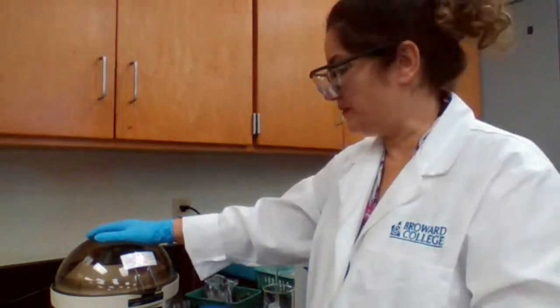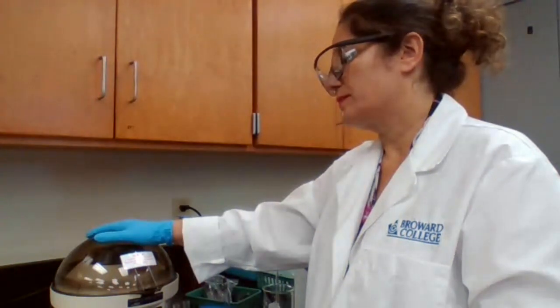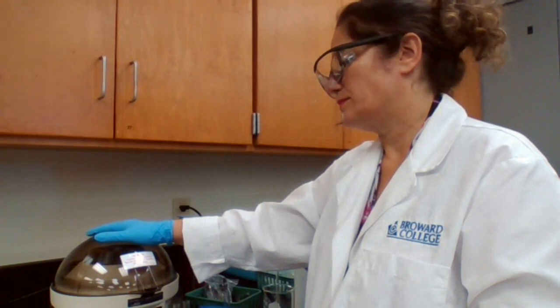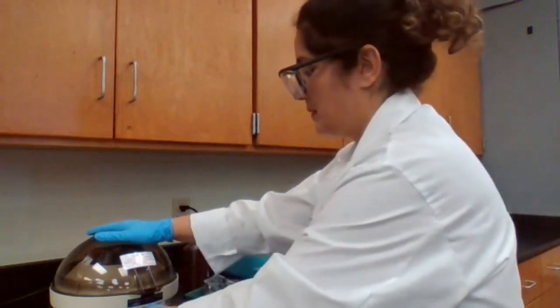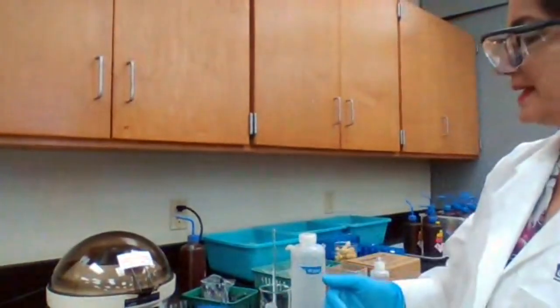"30-second centrifuge should be sufficient." Okay. We're going to wait until the centrifuge stops before we take it out.